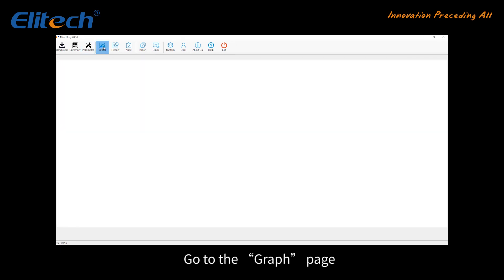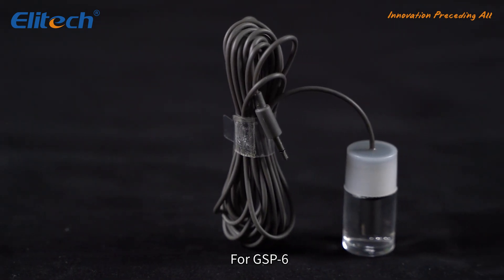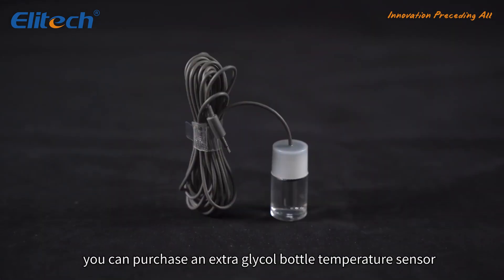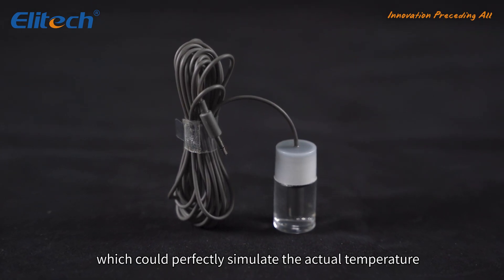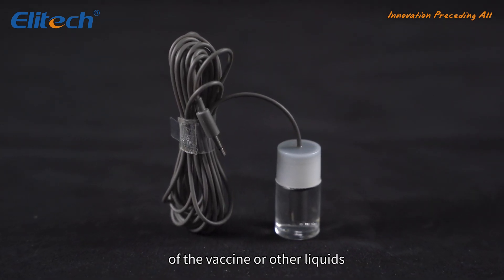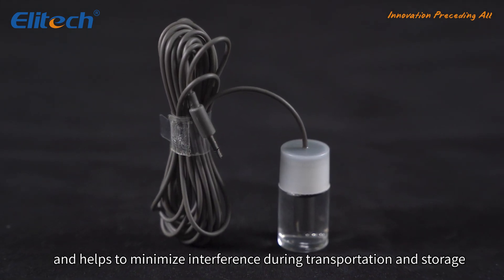Go to the Graph page, where you will find a graph to better analyze the data. For the GSP-6, you can purchase an extra glycol bottle temperature sensor, which could perfectly simulate the actual temperature of a vaccine or other liquids and helps to minimize interference during transportation and storage.